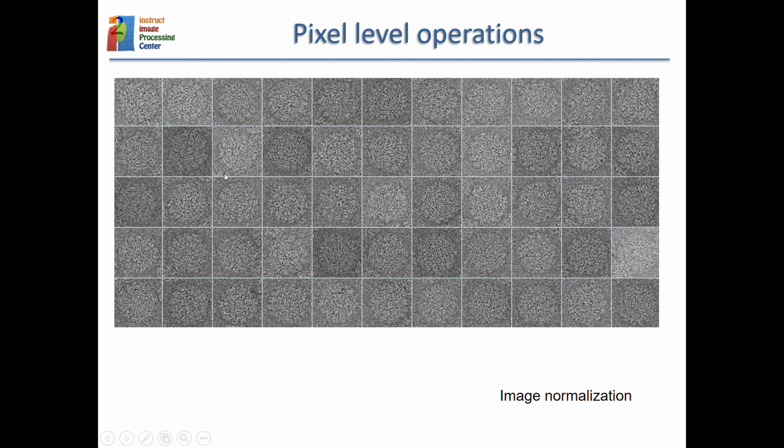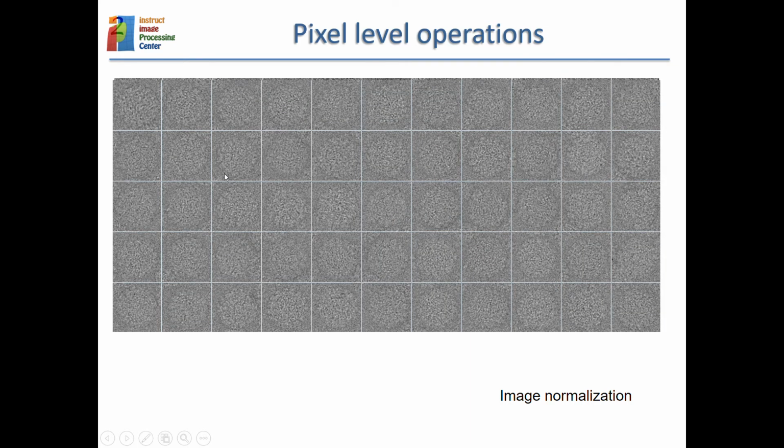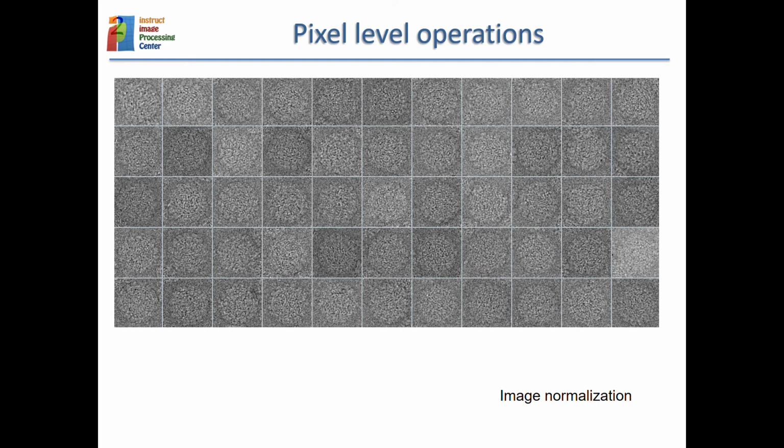You can force, for instance in the viewer, to make all of them more consistent, with just a single transformation for all of them. You compute the minimum and maximum over all the images, and then you use that transformation. And you can really see the difference.